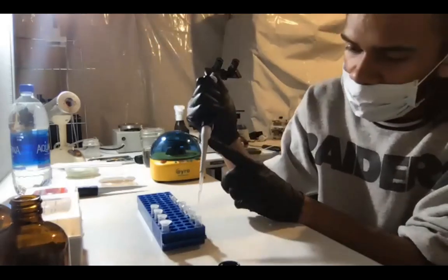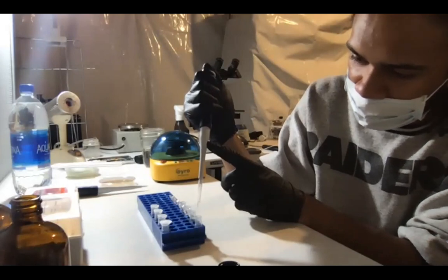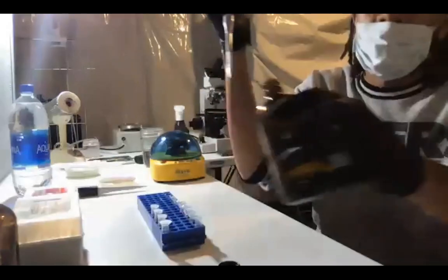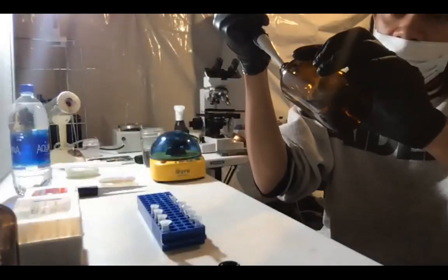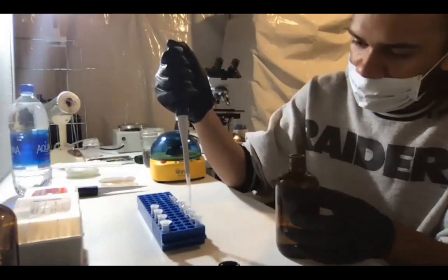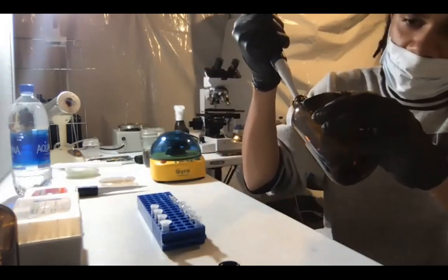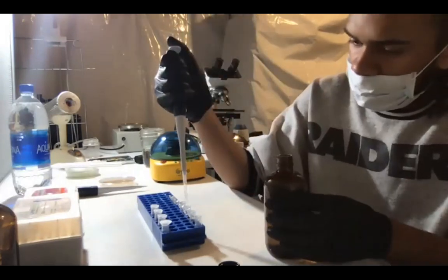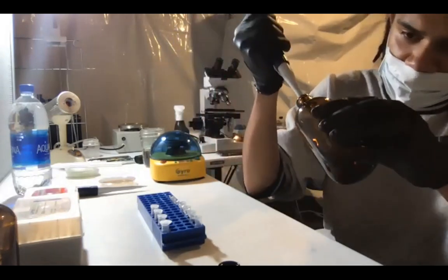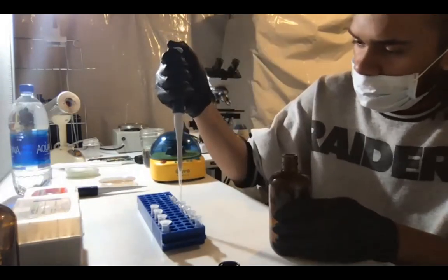And then without sticking this into the tube, I'm just going to squirt this liquid in and go to the second stop. That'll get all the liquid out. So again, I go to the first stop, pull up my extraction solution slowly, release it to the second stop into the next tube. First stop, pull it up slowly, release into the third tube, to the second stop. Then the first stop, pull it up slow, and then put it in there to the second stop.